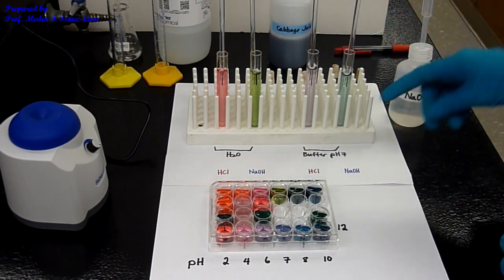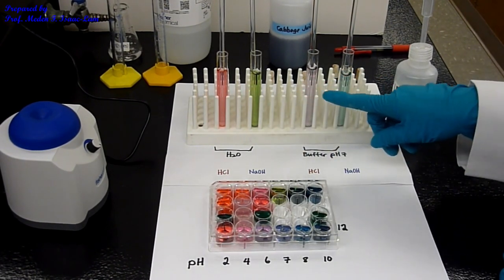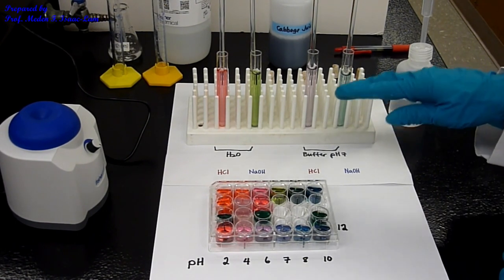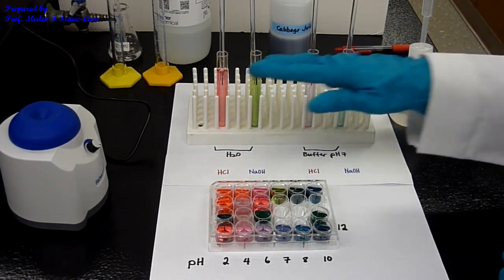As you can see, the color change for just the water is much more intense compared to the buffer. So this means that the buffer is resisting the change in pH more than the unbuffered solution.